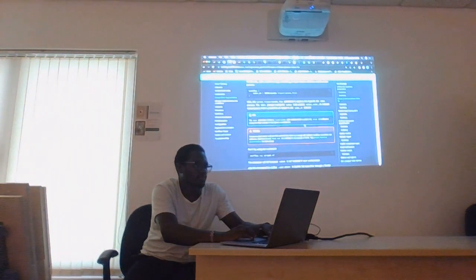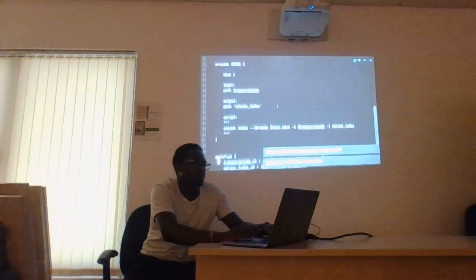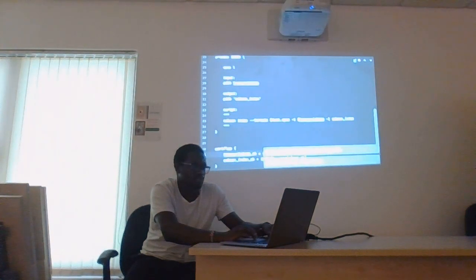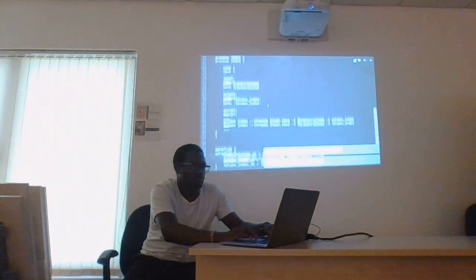Okay. So the directives, we can specify the number of CPUs by including that as a directive here. So we want only one CPU to be used in the process. So this will capture this value given in the directive.